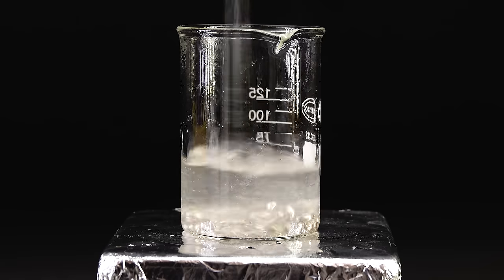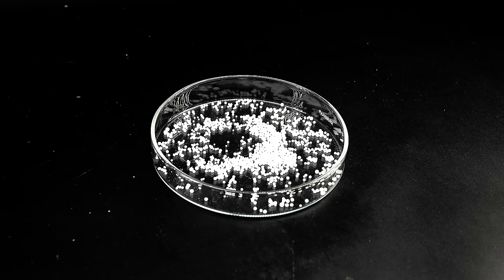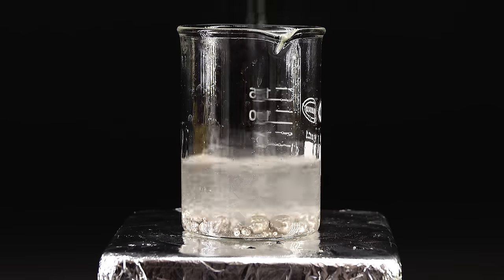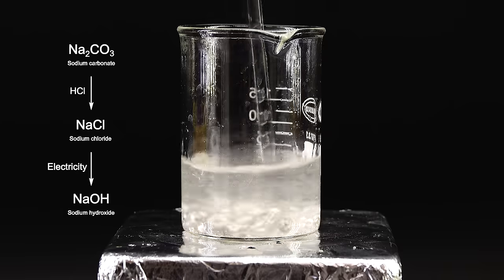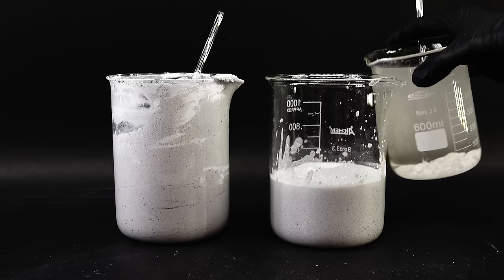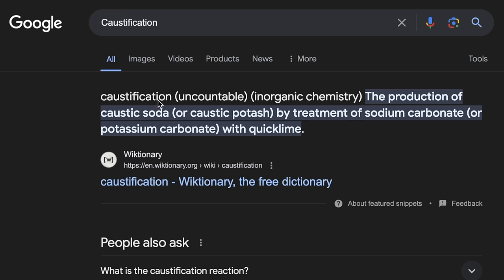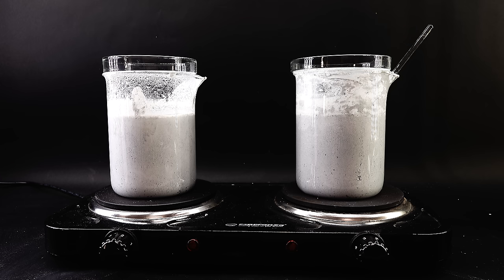Now for the second step, I have to convert my sodium carbonate into the more reactive and dangerous sodium hydroxide, and this is where things become a little tricky. After some digging, I found a really old method called caustification — it involves reacting sodium carbonate with calcium hydroxide. The products are sodium hydroxide and calcium carbonate, which is incredibly insoluble in water and drives the reaction forward. The reason I chose this method is because calcium hydroxide is something I can reasonably make, unlike trying to set up some dark-magic-powered electrolyzer.